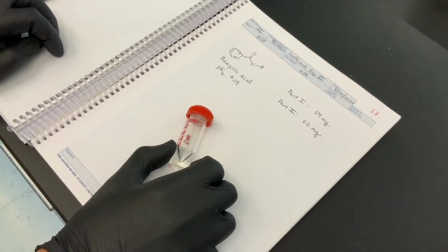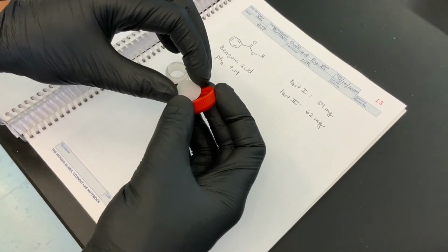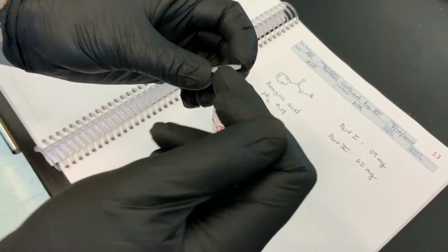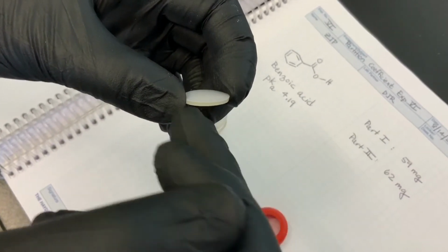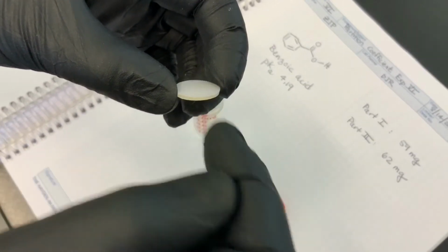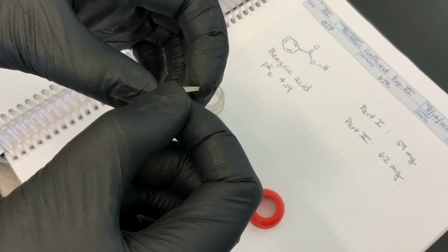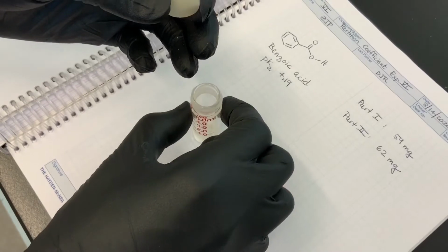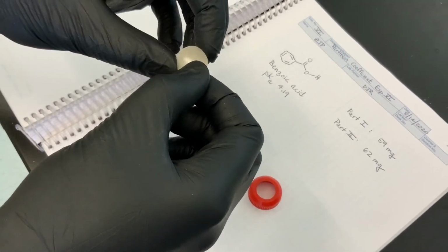So here's our 5 milliliter reaction vial. We've got the screw cap, and then we've got a septum. And so the septum on the top face, if you can see this properly, which is shinier, that's Teflon coated. So we're going to have this non-reactive side face the interior of our reaction vial. And then the softer side is faced outward.